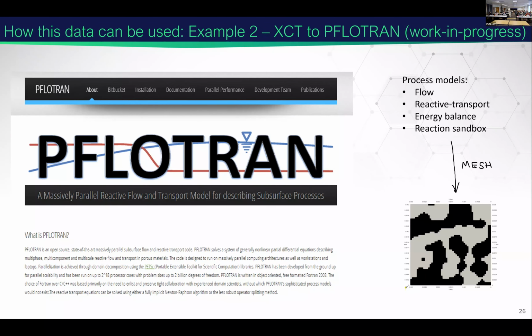You can also incorporate thermal effects, like how temperature changes under different perturbations due to anthropogenic activities, by incorporating that into the energy balance. You can couple all of them in a sequential or coupled way and solve on a mesh with very high resolution, such as the one I've shown below, a small segmented volume or the entire segmented volume, on HPC systems.